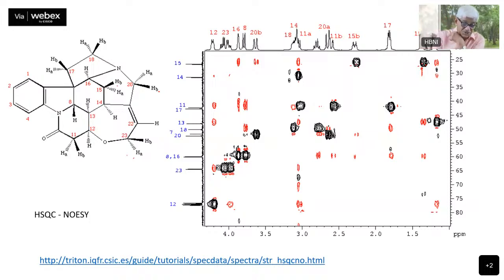Therefore, you see here in the structure also, it is indicated which one is going down, which one is coming up. So this stereochemistry is quite clearly indicated there, and that is consistent. That must have been derived from the NOESY spectrum. The normal two-dimensional NOESY, you cannot get this. The normal 2D proton NOESY, you cannot get this sort of detail.